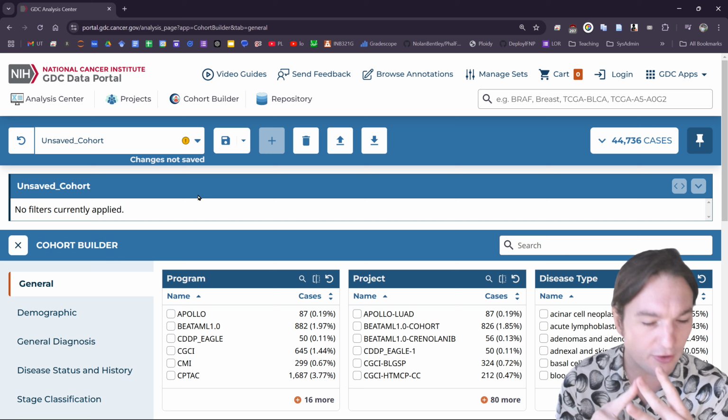And then you're comparing their gene expression, and then seeing if it is differential through various statistical analyses. In my class, using the program DESeq2. However, in order to do that, I first need to identify what groups the different cases of data should be in. Additionally, if I don't even really know what my comparison is going to be, I need to go in with the scientific question and try to resolve that.